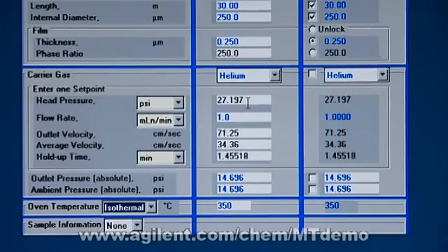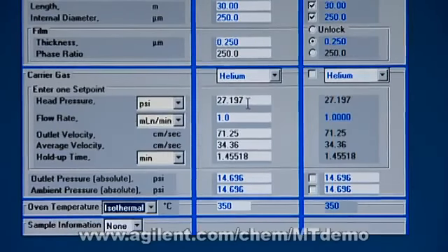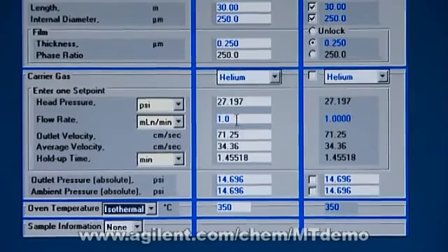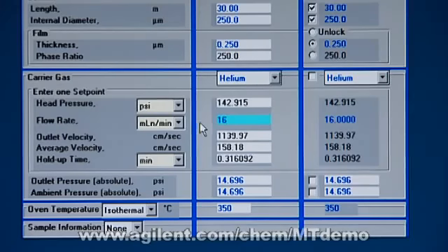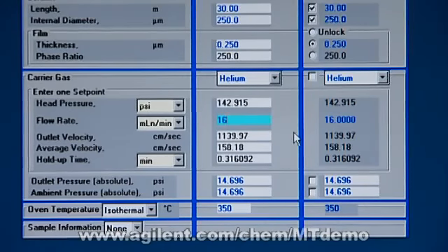Now, let's say I want to do a flow program. How high of a flow can you go to? Well, let me try 16 mils a minute under these same conditions. Now, the translator says I almost need 143 psi. And most of the standard instruments we have have 100 psi inlet.